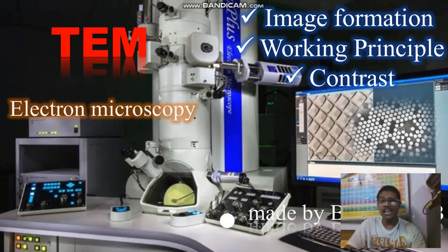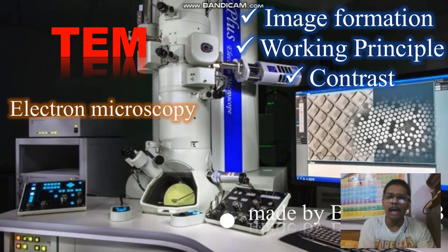In this video we will discuss a very important topic for research in biological science, which is called TEM. Transmission electron microscopy is a very important technique to investigate the inner structure of a protein, or cellular materials, or nanostructures. Electron microscopy uses an electron beam instead of light, as in light microscopy. Light microscopy uses light, and electron microscopy, as the name suggests, uses electrons to visualize the inner details of a material. TEM stands for transmission electron microscopy.